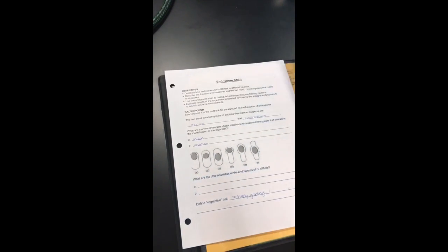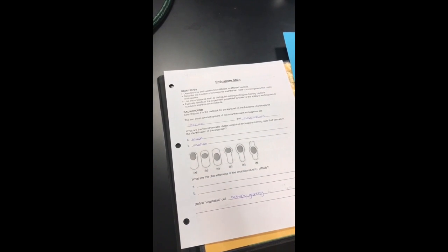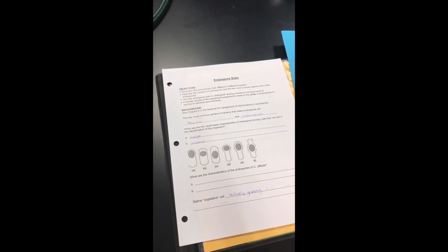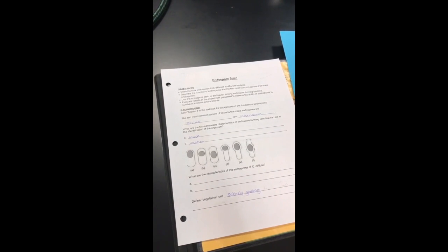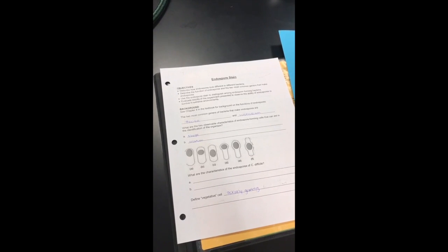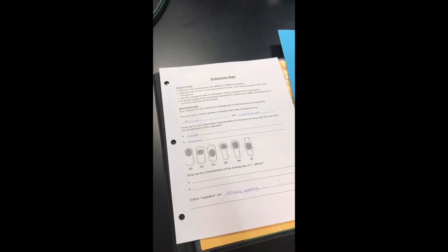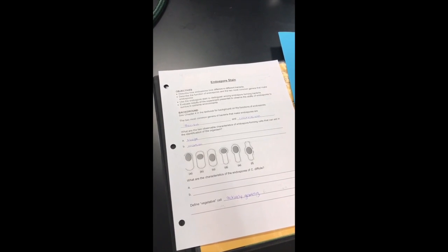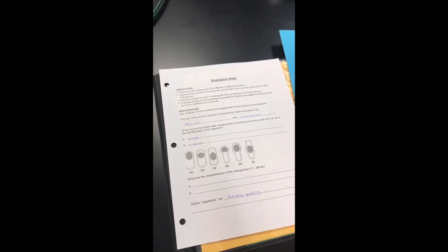The next question asks us about C. difficile. We do not have that organism today, so we're going to skip that question. You'll notice the last question says define a vegetative cell. Well, they're actively growing rather than forming spores. They are red at first, but usually as they die and form endospores, they'll show up green. And that is after an endospore stain.